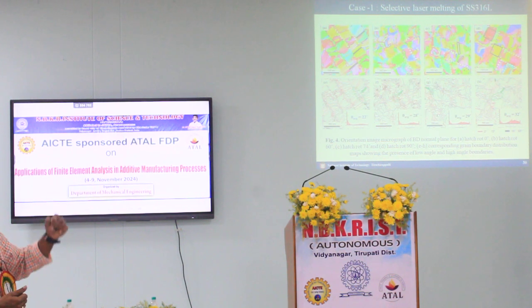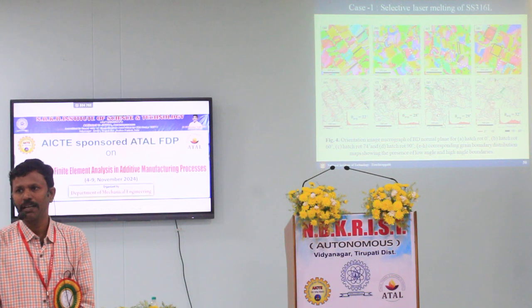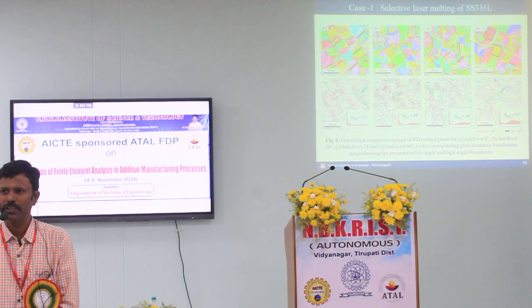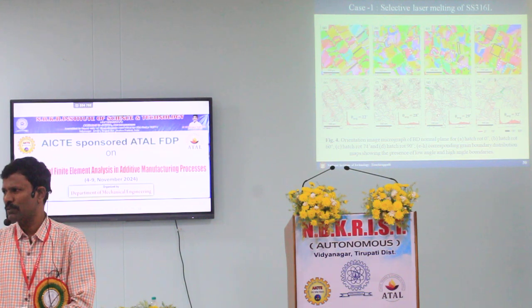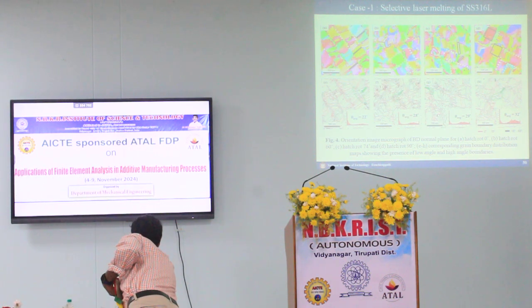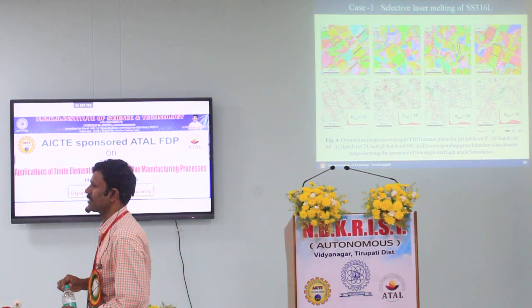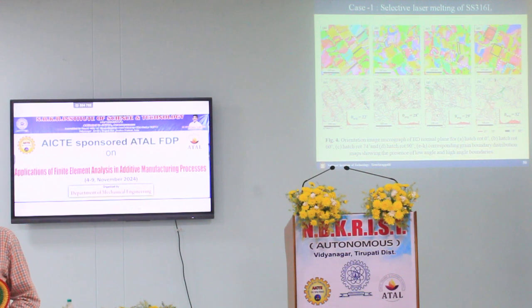It appears to be like a microstructure, but it's not really a microstructure. It is the orientation imaging map, we will call it. OIM, orientation imaging map, or inverse pole figure map, Kernel average misorientation map, all are maps. Some people use terminologies like micrograph also, something like that. But strictly, these are all maps because every location, based on the diffraction, based on the lattice orientation, will give a color. That's it.